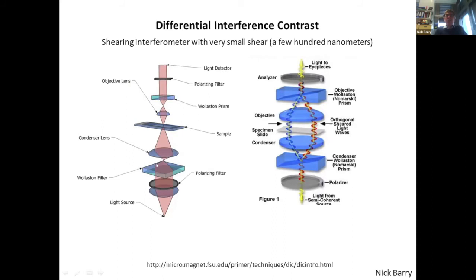It's of the order of half the diameter of the point, so something at the diffraction-limited level, and they're split by polarization. One polarization and the other polarization pass through the sample, slightly shifted from each other, and then they're recombined by a set of reciprocal optics up the top here, and a polarizer is used as an analyzer in front of the detector.